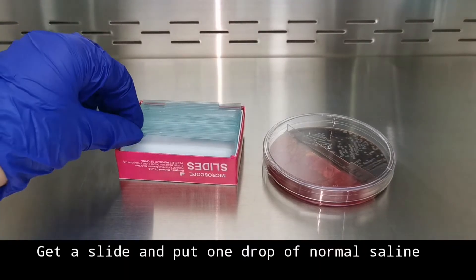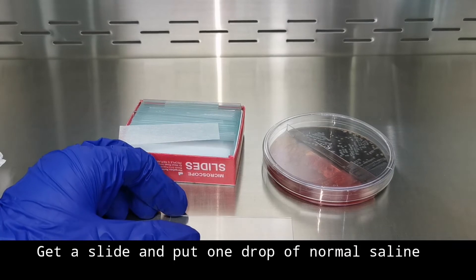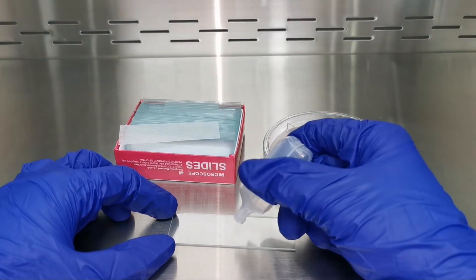How to do the gram stain. Materials needed: glass slide, the culture, inoculating loop, and normal saline solution (NSS). First, put one drop of normal saline on the slide.